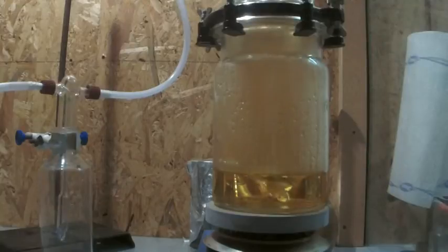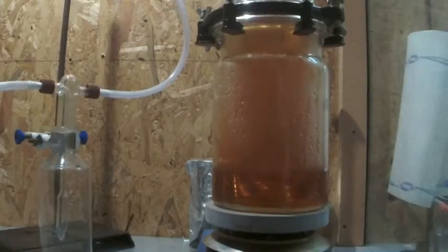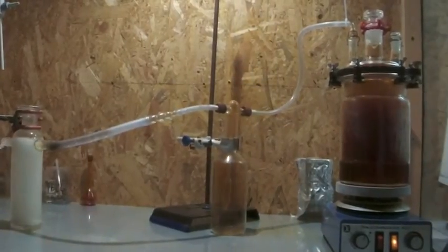As more and more nitrogen oxides are forming, the mixture gets darker and darker and brown fumes gas out of the liquid and fill the vessel. At one point the reaction kickstarts and a big amount of nitrogen oxides is formed. The gas volume was way too big for the gas wash bottle, so my entire fume hood was flooded with brown gases. Luckily I am always wearing my gas mask when some kind of unexpected gas outbreak could happen.